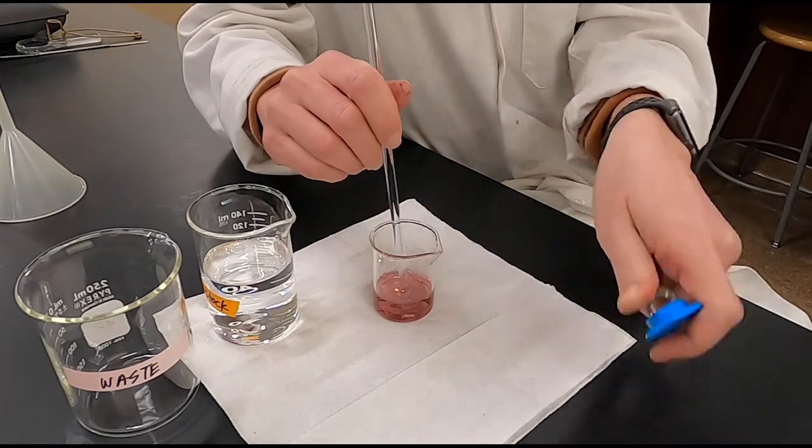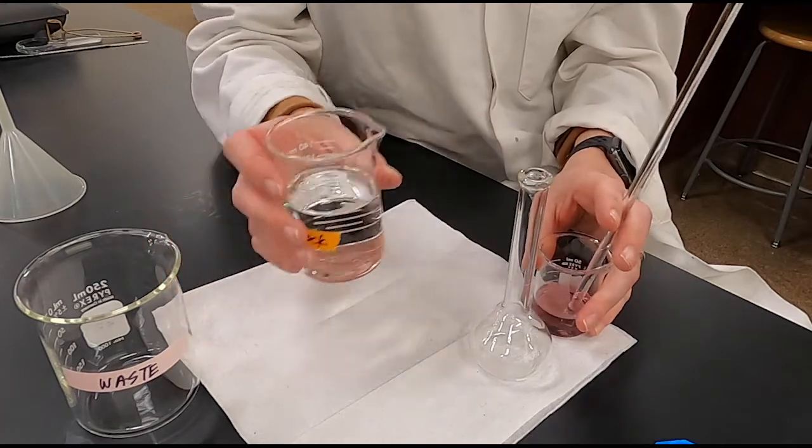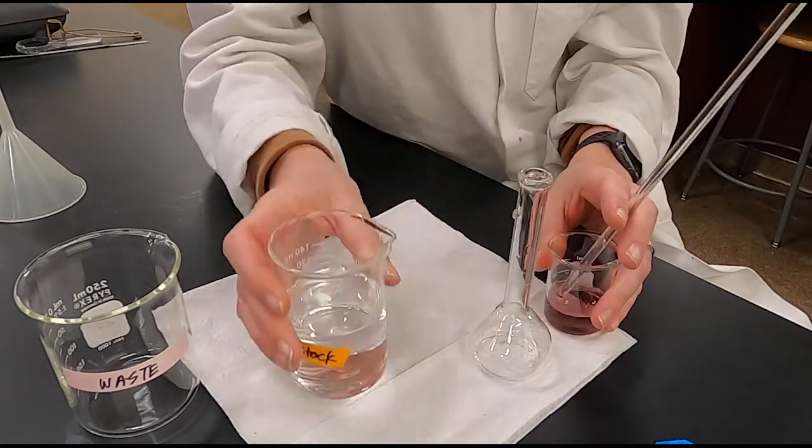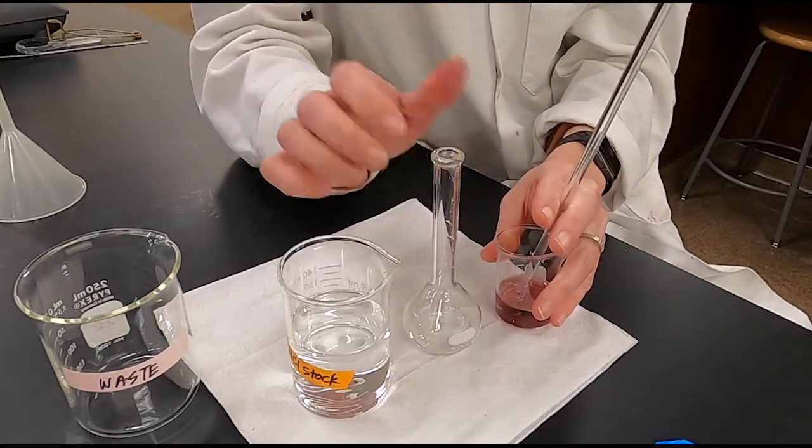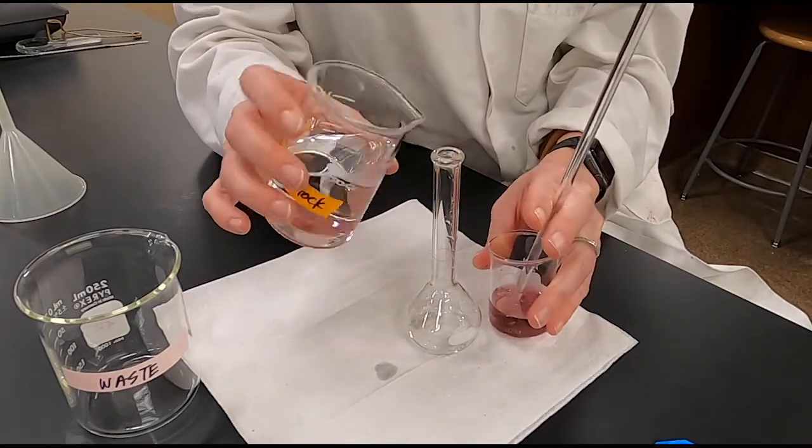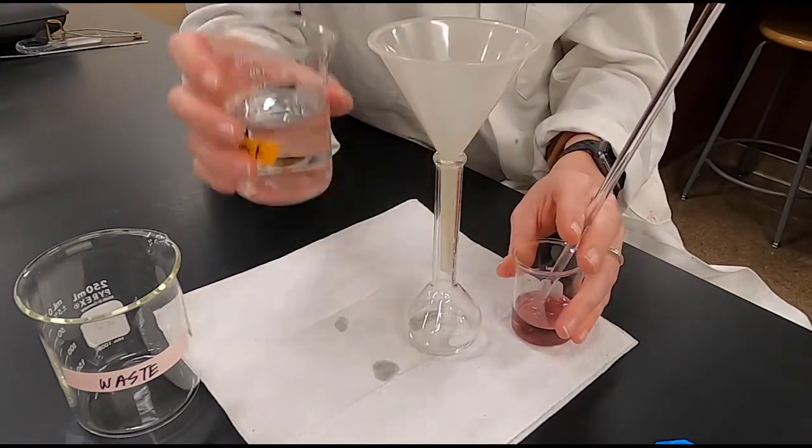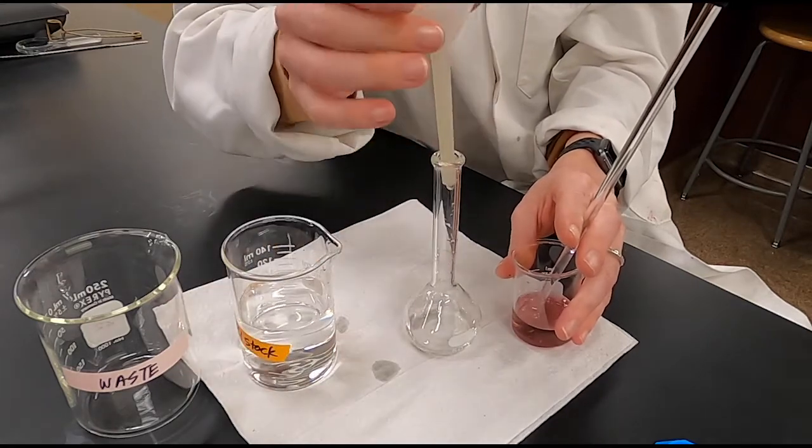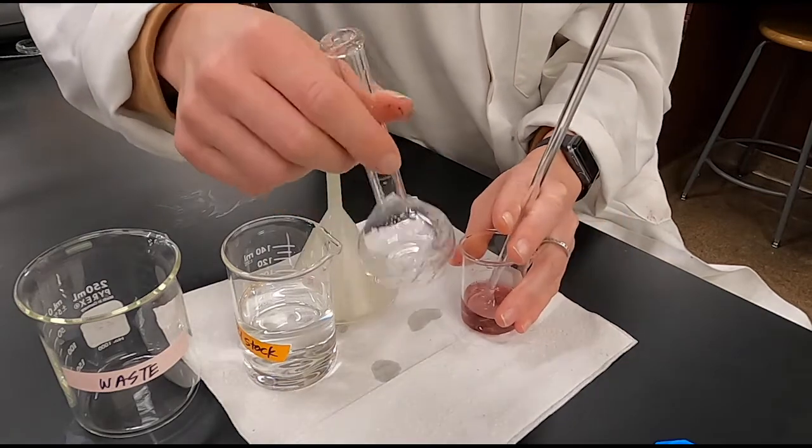I'm about ready to transfer it to this volumetric flask. We're going to do a quantitative transfer, so notice that I'm not putting the stir rod down on the paper towel because I don't want to lose any of my solution. I'm going to make sure that all of that gets transferred into the volumetric flask. The volumetric flask has some water droplets inside, so I'm just conditioning it with the hydrochloric acid solution since that's what we're using as our solvent.